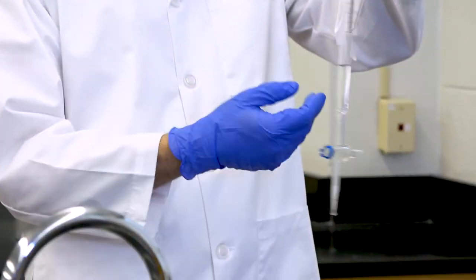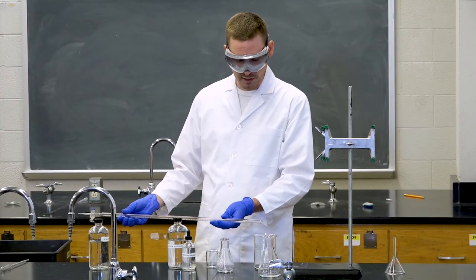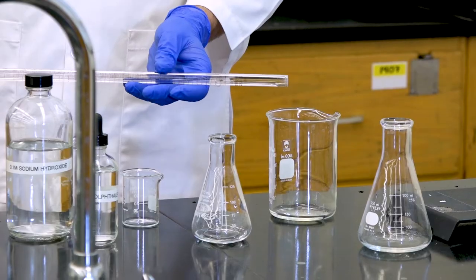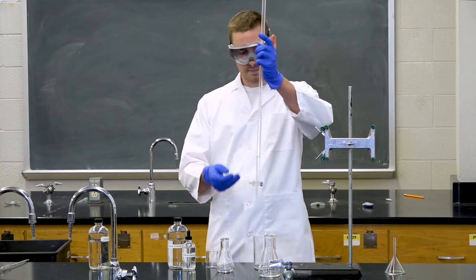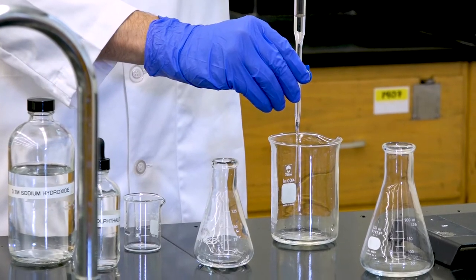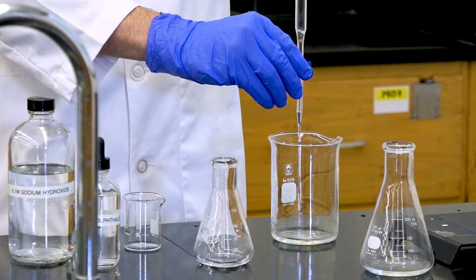Once you have added it to your burette, you can then move it to the side, holding the opening above a waste container, and then slowly rolling it in your fingers to rinse the burette on all of its inside surfaces. You can then dump it out into your waste container. You'll need to do that 2 more times in order to sufficiently rinse your burette for our experiment.